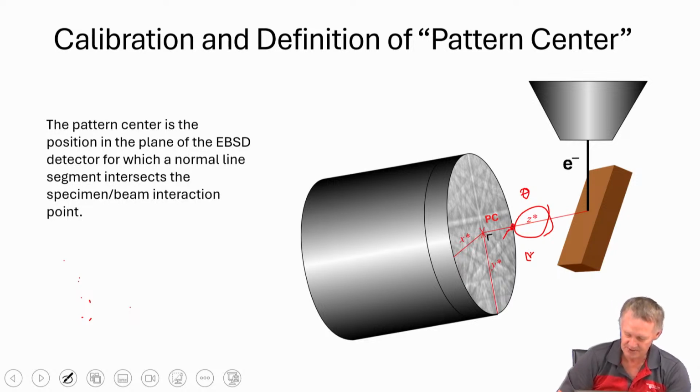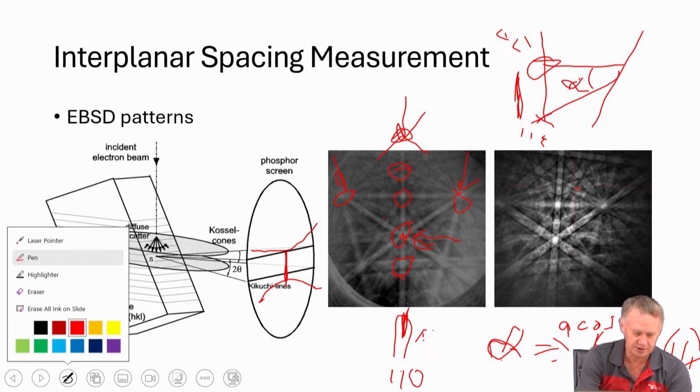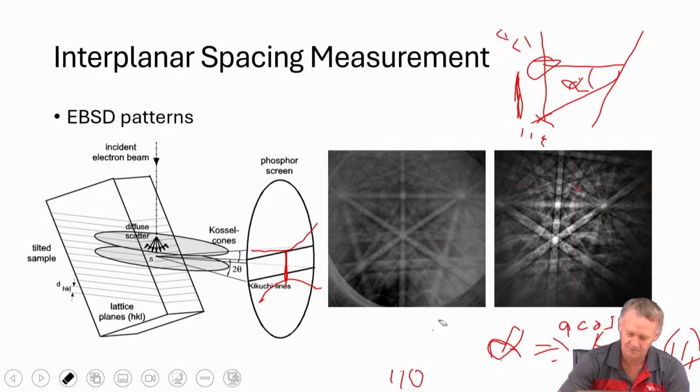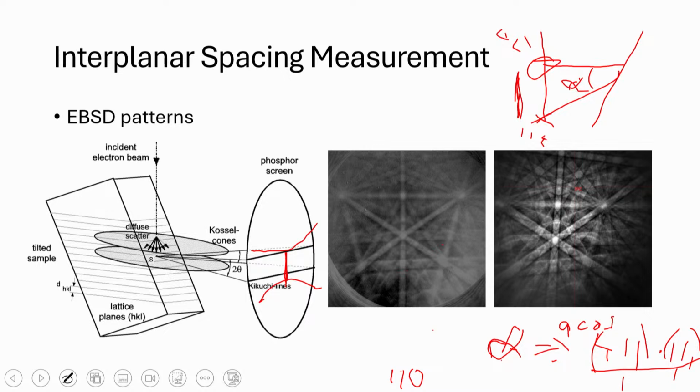And so on the pattern, if you look at where the pattern was, let me try and do this again. Then he would get the shadow of those spheres, and they turn into ellipses because it's distorted, right?